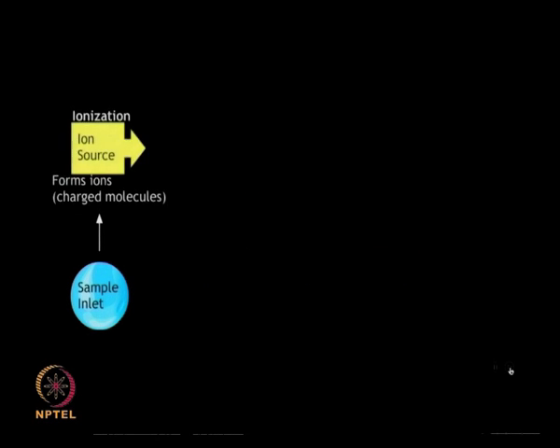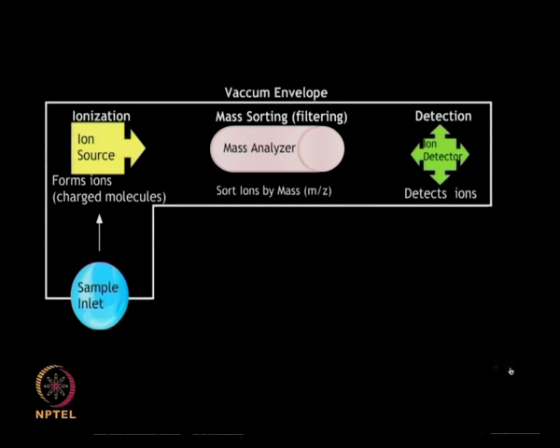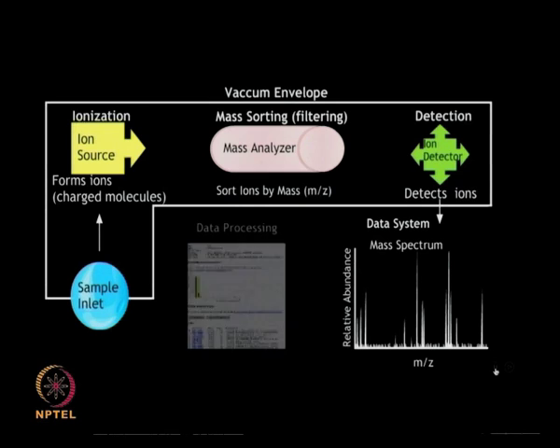A mass spectrometer is an instrument that produces charged molecular species in vacuum, separates them by means of electric and magnetic fields, and measures the mass to charge ratio and relative abundance of the ions thus produced. It is being increasingly used for detection and analysis of proteins from complex samples.